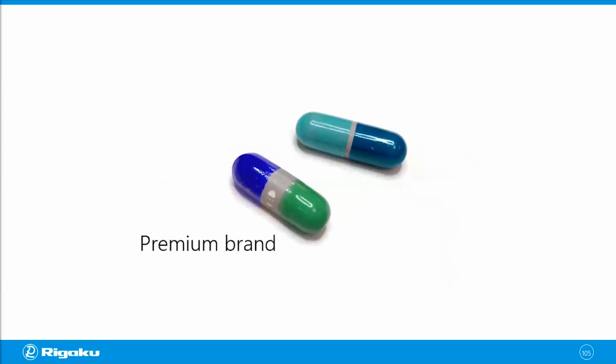This one is a premium brand painkiller, and this one is a store brand. Both of them are labeled as rapid release. And those gray bands supposedly have something to do with the rapid release. So let's take a look at them with Xray CT.